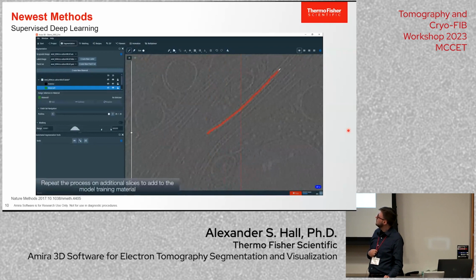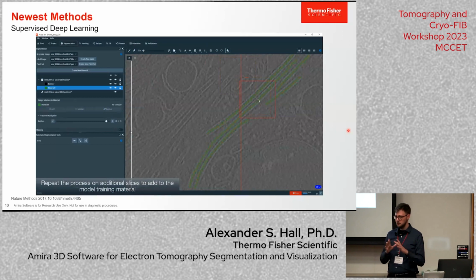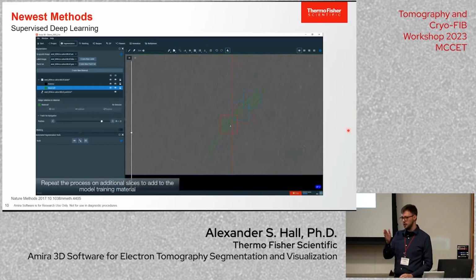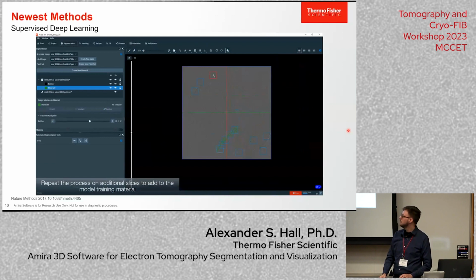All right, so they do more and more. And then eventually they're going to click on a button that basically allows for a very, what we call shallow network machine learning approach, which is the same as the UNet, but there's fewer layers, which makes the whole process much faster to train. And this allows you to do sort of an expert in the loop kind of behavior.